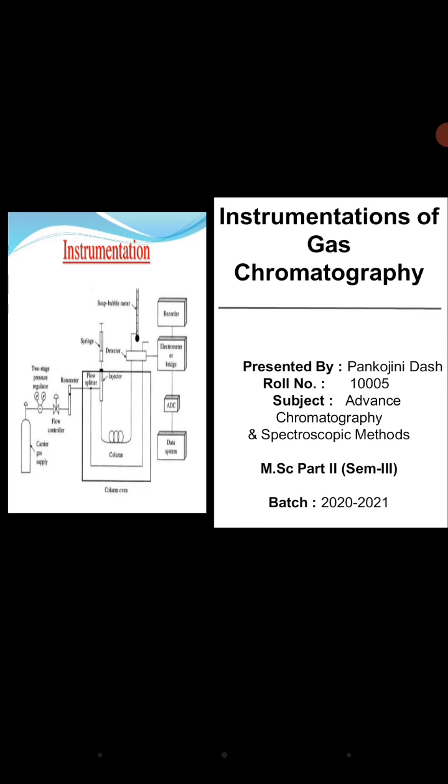First of all, let us know what is chromatography. Chromatography is a laboratory technique for the separation of the mixture. The mixture is dissolved in a fluid called the mobile phase, which carries it through a system on which is fixed a material called the stationary phase. This is important for the separation of DNA, protein, different chemical molecules, so that each substance can be studied thoroughly.